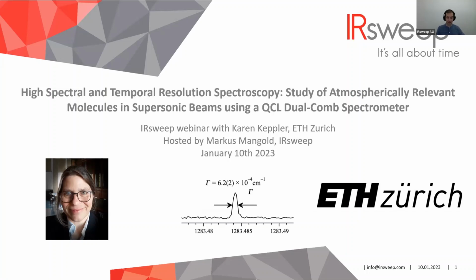But she also did a really great job analyzing some data that came out of a joint measurement campaign between the folks at ETH Zurich and us at IRsweep, where we were developing this combined high spectral and high temporal resolution mode of QCL Dualcomb Spectroscopy, and we did a study of atmospherically relevant molecules in supersonic beams using a QCL Dualcomb Spectrometer. And I'm very happy that you are going to present those results.